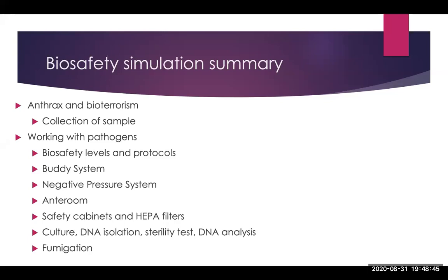They won't show you, but they're going to do a DNA isolation. They'll tell you about it, but you won't actually do that part yourself. But you will do a sterility test, and then you send off the isolated DNA for analysis, and then that comes back and they give you the results. So you only really do culture and sterility tests, and you use other people for the DNA stuff. Later on in the class, I'm sure you'll learn how to work with DNA, but just not in this simulation. And then you'll end with a fumigation and your test results for the analysis.